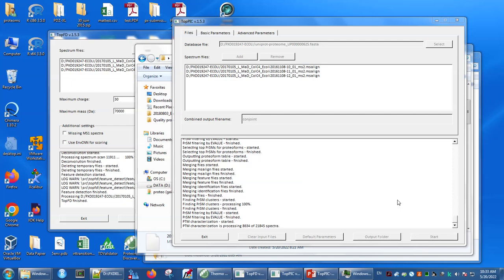In this case, we expect that the proteoform roster for one of these files is a pretty good representation of what we might find in one of the others. This PTM characterization process is one that's worth saying something about, because the way that TopPIC does it is rather special. TopPIC is expecting, in the way we've configured it, one place of mismatch between what the spectrum peak ladder says and what we predict from a given proteoform sequence.